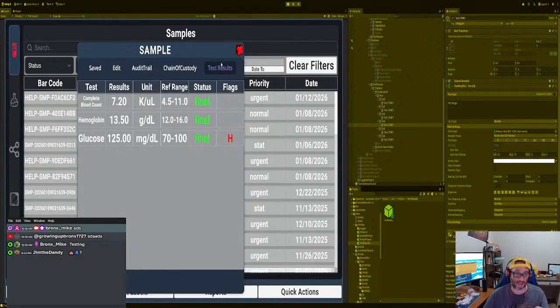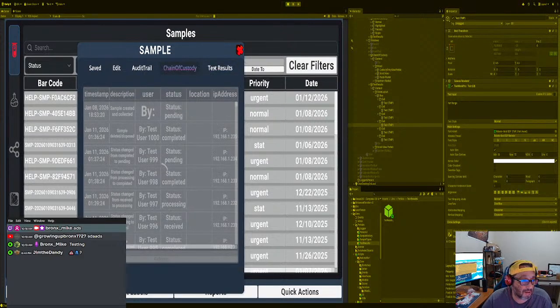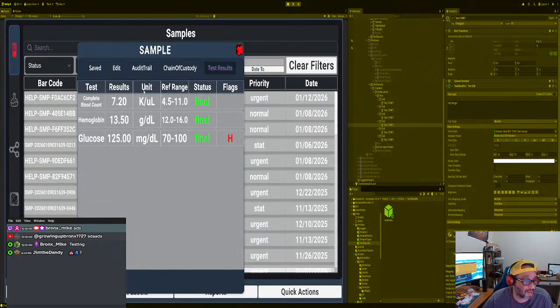Like this, we shouldn't have different shades, different colors on that and all that. We shouldn't have that. It just confuses the person.